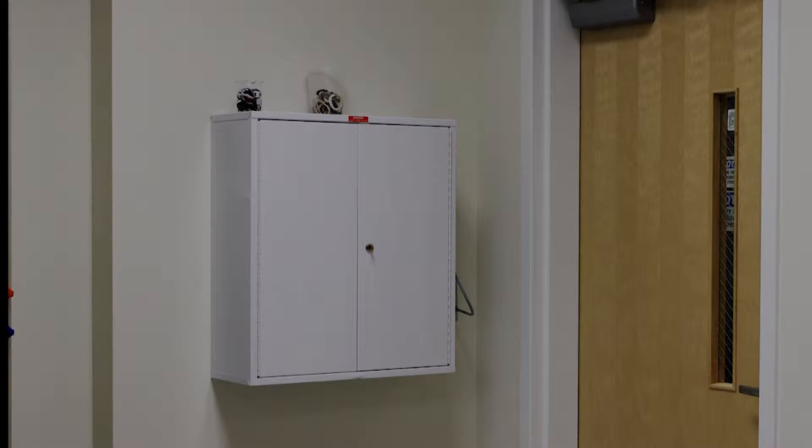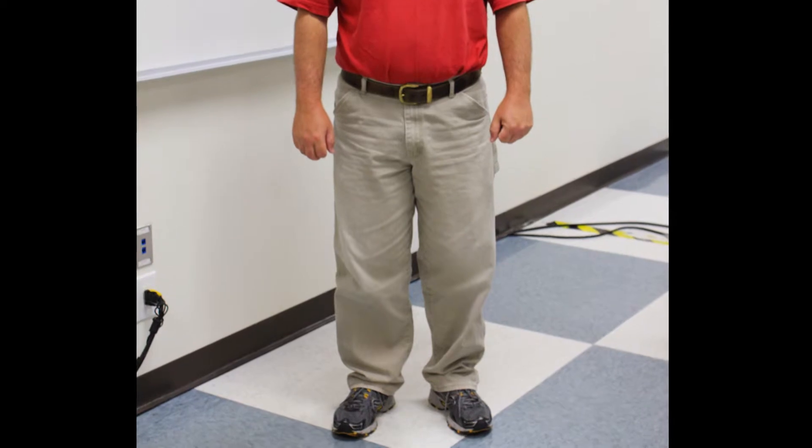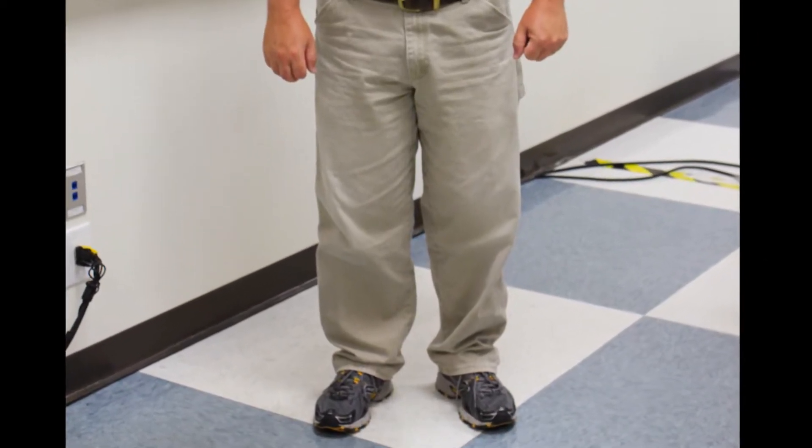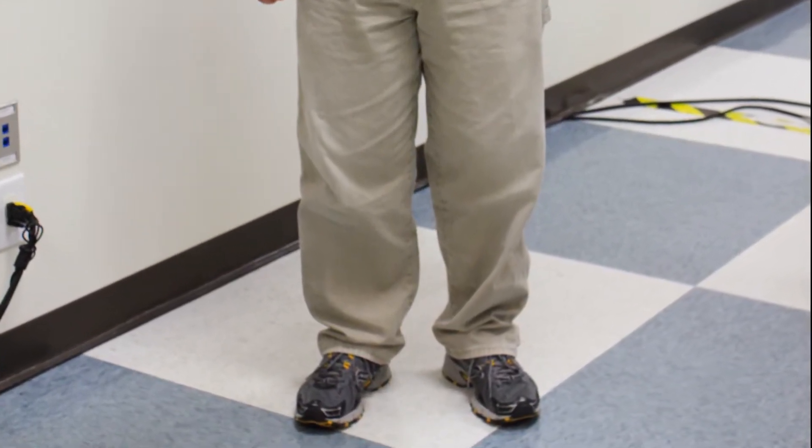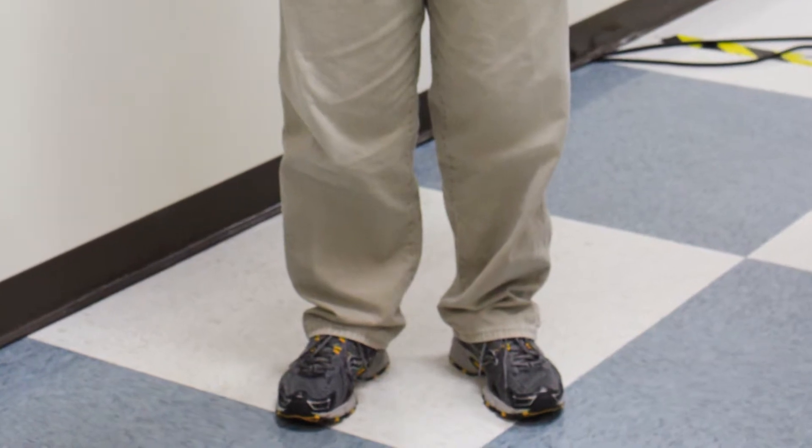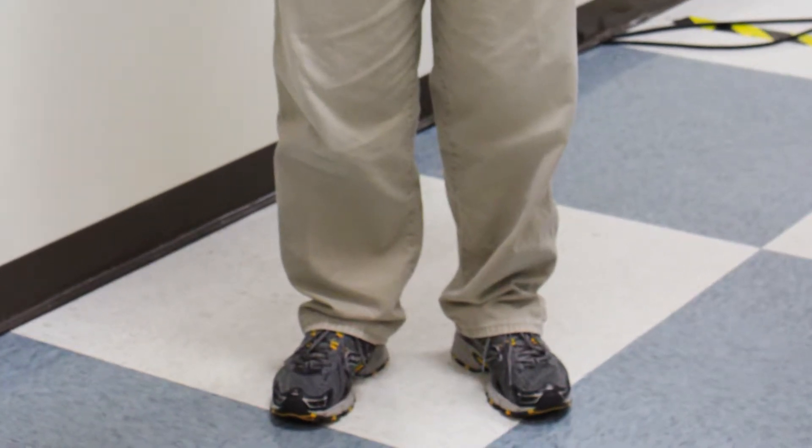A dress code is enforced in lab for your safety. Hazards in the lab include spilled chemicals and broken glass. Shirts with sleeves are required to protect your upper chest. Shirts cannot be so short that your belly is exposed. Long pants or a long skirt must be worn to protect your legs. Shorts are not allowed, even if they cover your knees. Closed toe and closed heel shoes are required to protect your feet. Sandals, flip-flops, and crocs do not meet this definition.